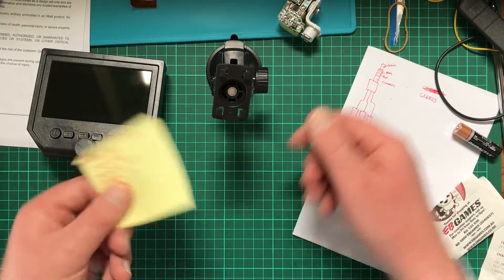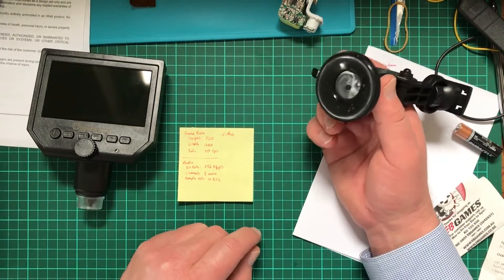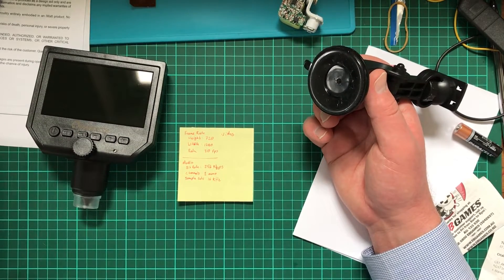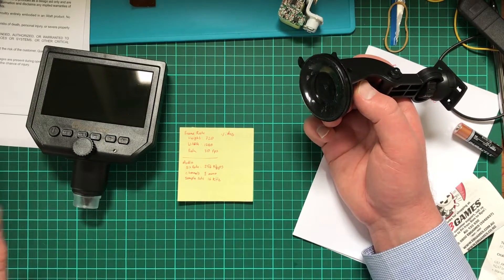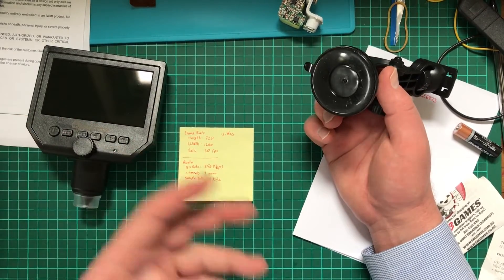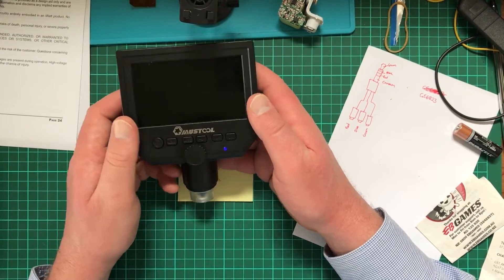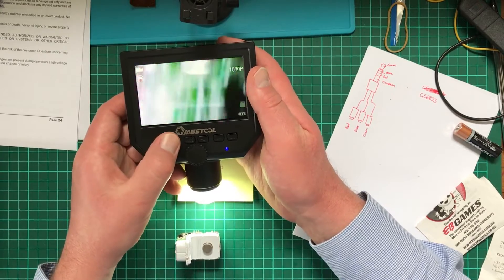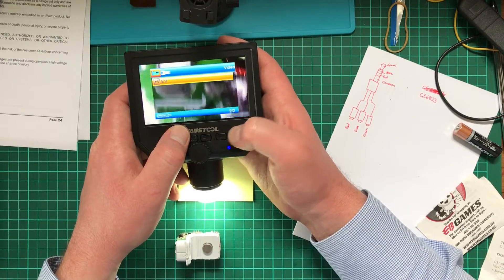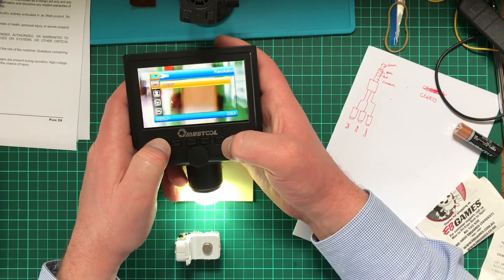We can probably ignore the earlier footage because I didn't have the settings right. As for the video rate, even when set to 1080p, it was only recorded at 1280 by 720. What I found strange: when you first play an audio or video file from this, you get this audio clank, like you're plugging in a headphone jack. I don't know why, so you do end up losing a little bit of storage space because of this audio file that's created — and even though it's not all that big, it's still useless. The videos come out in AVI, which I'm not particularly happy about, and there doesn't appear to be a way of changing that in the settings. Disappointing — but then again, it is a piece of crap from China.